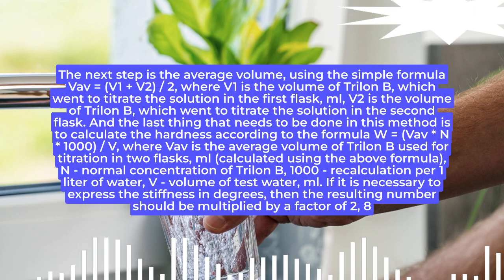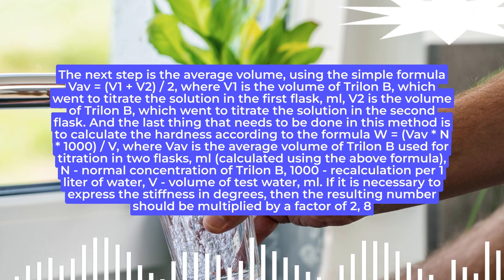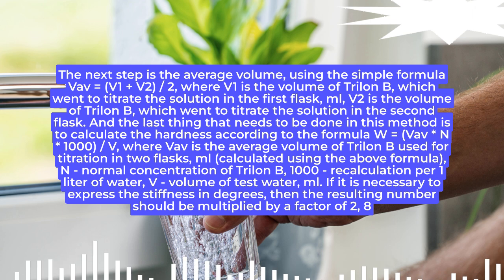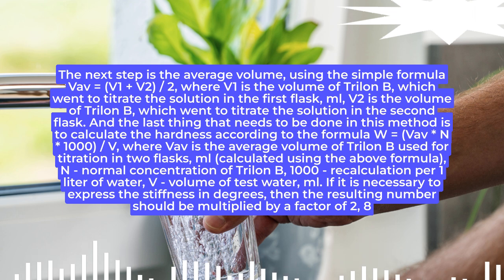Step 4. The next step is the average volume, using the simple formula V_av equals (V1 plus V2)/2, where V1 is the volume of Trilon-B, which went to titrate the solution in the first flask, ml, V2 is the volume of Trilon-B, which went to titrate the solution in the second flask.